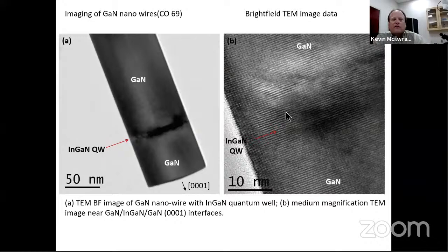So we have lower mag. We get an idea of what's happening. I need that lower mag because if I show you just this high mag, it doesn't give you perspective of really what I'm looking at. So we have a really good range of that.